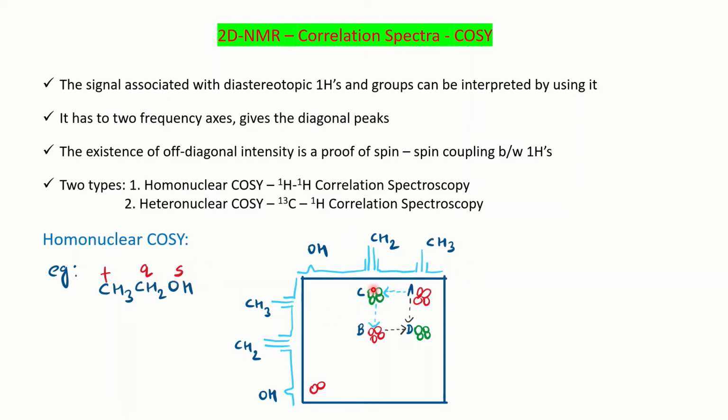And you can notice with respect to the chemical shift, since the quartet is attached to the electronegative atom, and we know the electronegative effect on the chemical shift, deshielding occurs. Therefore, you have a high delta value for the quartet as compared to the triplet, and then for OH, we know the range for alcoholic OH, accordingly it will appear.